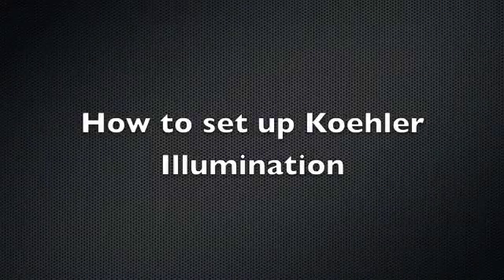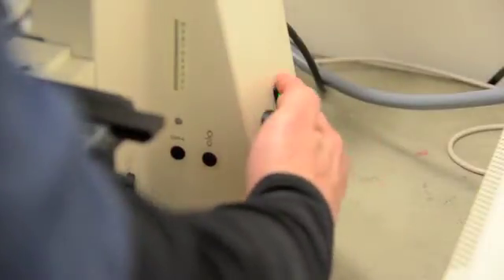How to set up Kohler Illumination. First, turn on the microscope.